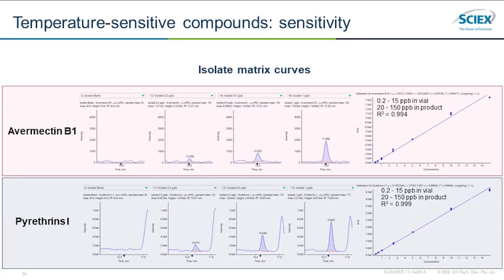Some of these might actually be other pyrethrins, but there are a few that even in natural plant you'll see. We haven't quite figured out what they are, but you'll notice them. So you'll really have to rely on retention time in addition to your MRM transitions to make sure you're not integrating the incorrect peak.